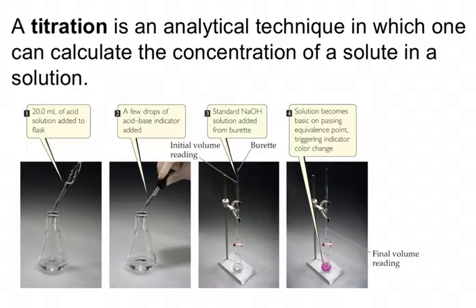Welcome everybody. Today's lesson has to do with titrations. Titration is an analytical technique in which you can calculate the concentration of a solute in an unknown solution.